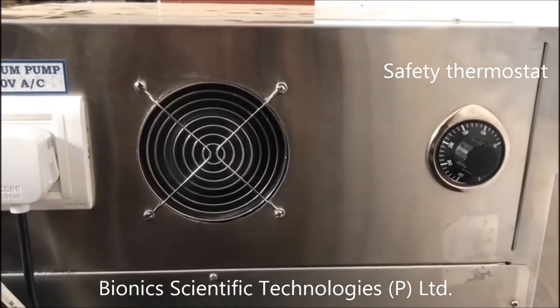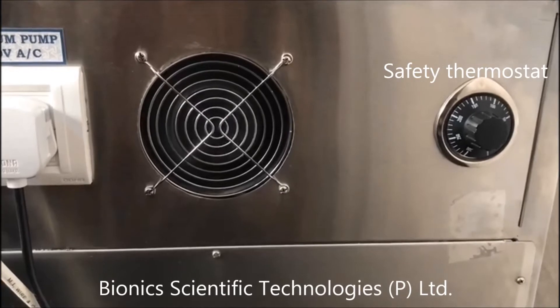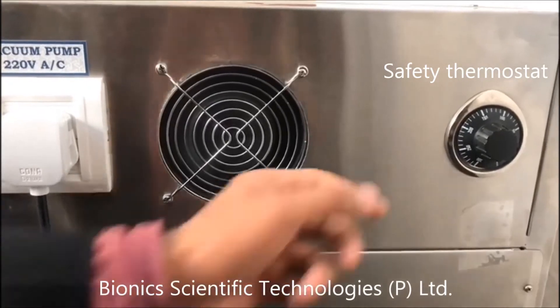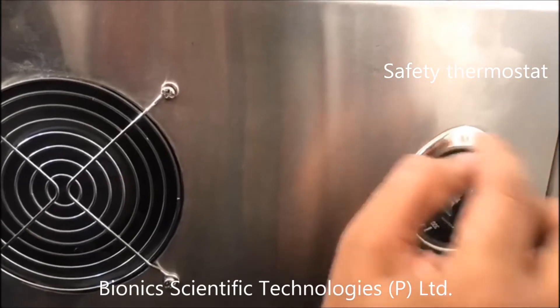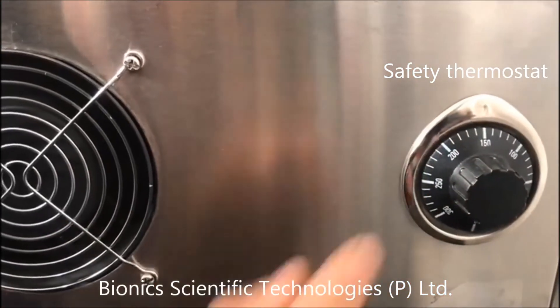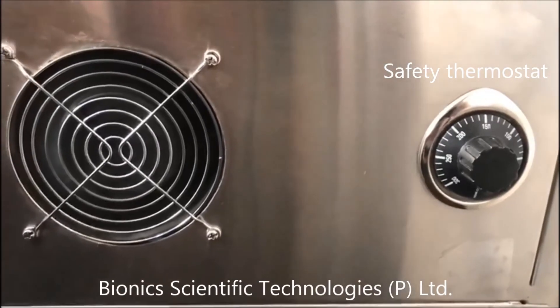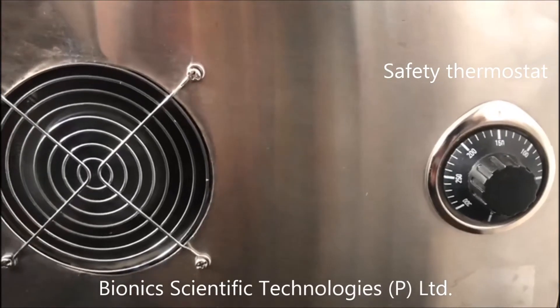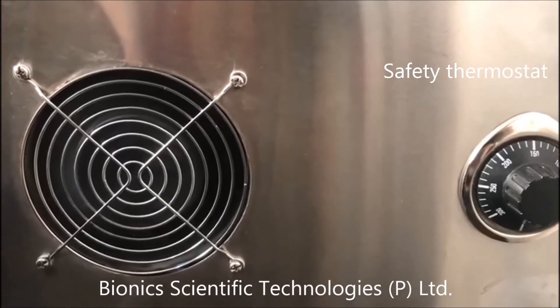The safety thermostat works when you are having a temperature — suppose 120 degrees Celsius — and for the safety of the machine, you have set here, suppose, 150. So what the safety thermostat will do is that if the machine temperature will rise, it will try to help it through its functions, and that's why it is called the safety thermostat.